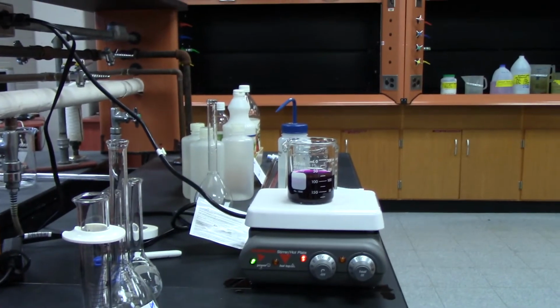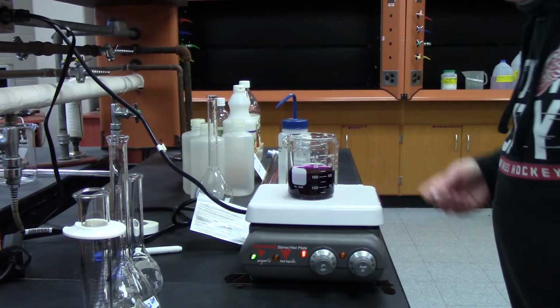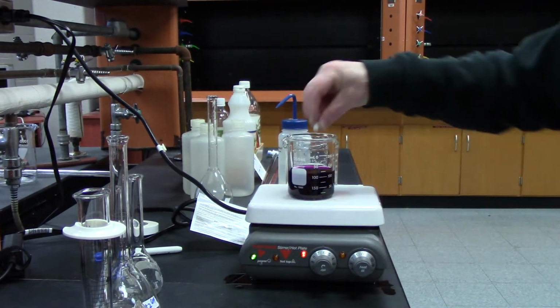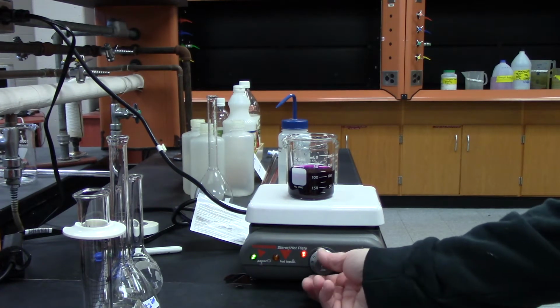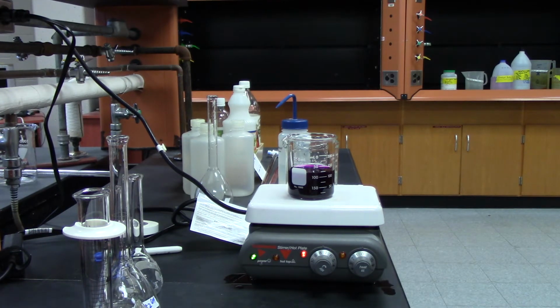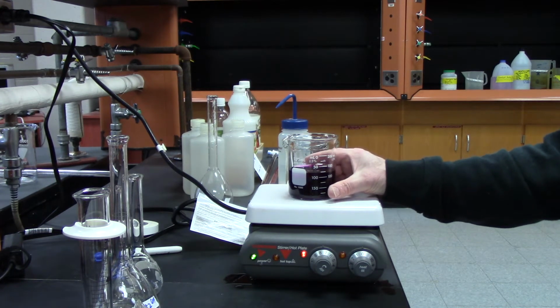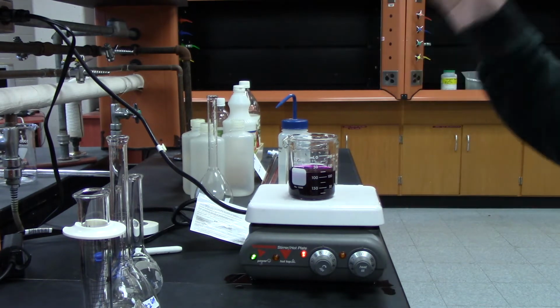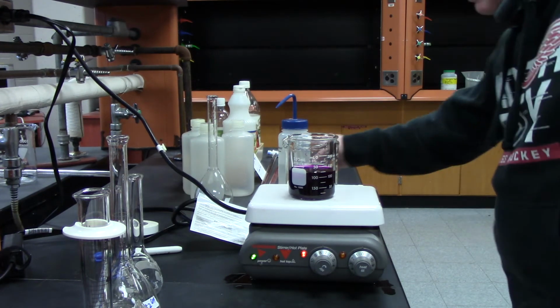Let me go down. And now what I want to do is mix it up a little bit. The way I'm going to do that, I'm going to take a stir bar and place it in the beaker and start stirring it. I really don't need a whole lot of mixing, but I just want to show you. What you want to do is get a nice little vortex. You don't want to just jump around, splashing all over the place. Vortex, you get a little tornado in there, and that's it.